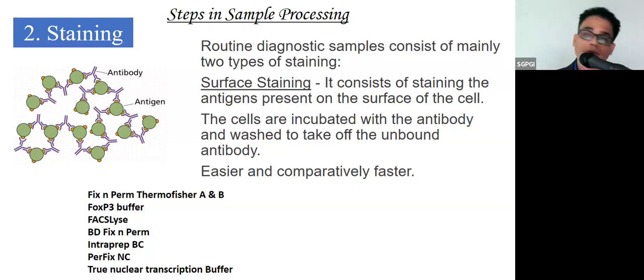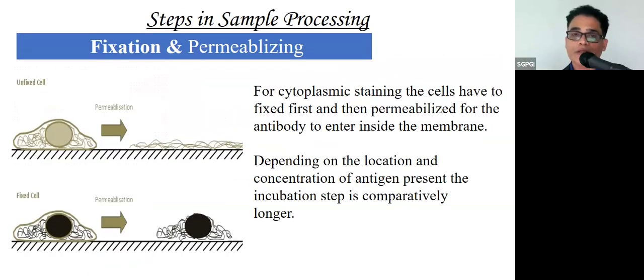We have different assays, standardized as per their expression for particular cytoplasmic and nuclear markers, like TdT. So it requires a different time. That has to be set again.